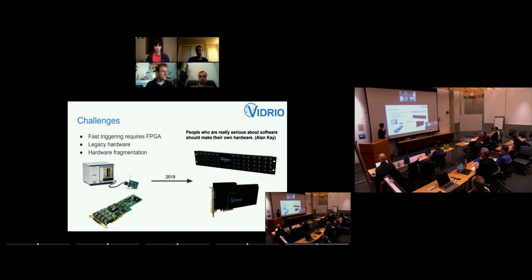And in the past, what we have done is we have used National Instruments hardware, such as this PXI chassis, and other data acquisition cards. What we have noticed is that it's okay to use this stuff if you want to get one microscope or two microscopes working, but we try to run on hundreds of microscopes, right?